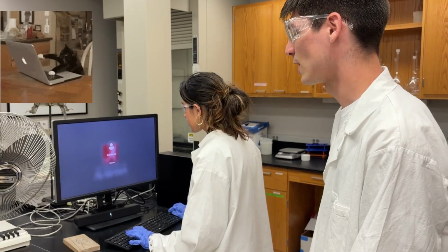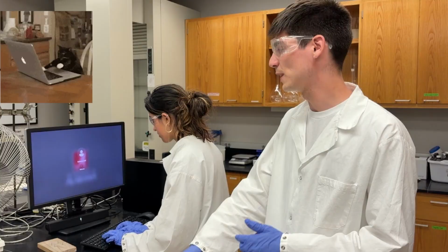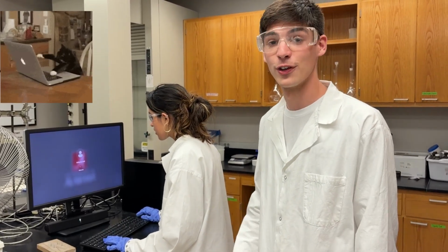When working the computer software, make sure to start each trial at the desired temperature you want the spheres to be at, and be careful when naming your trials so you know which one is which. And don't forget to bring your flash drive.